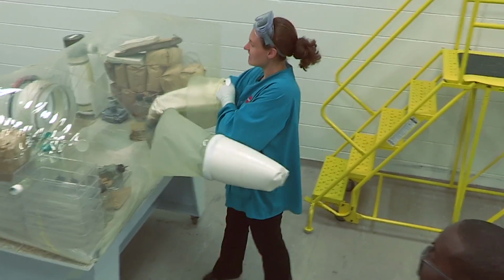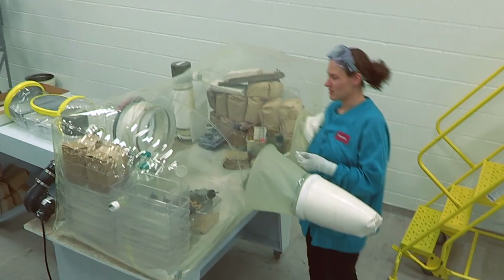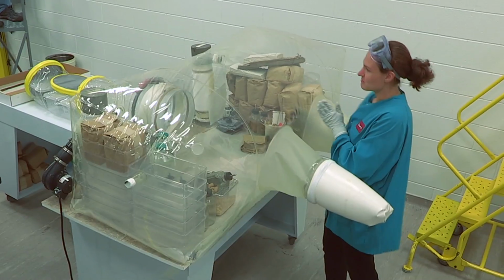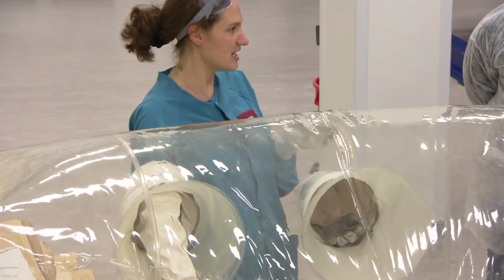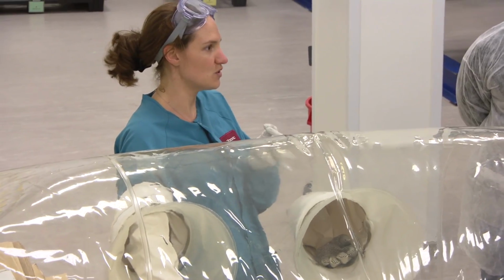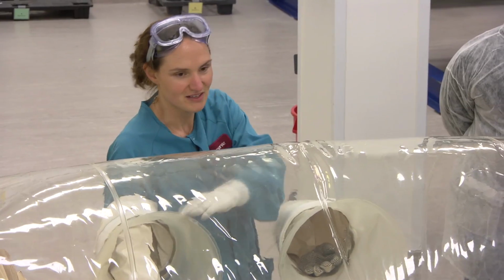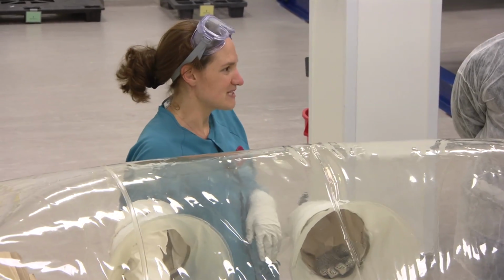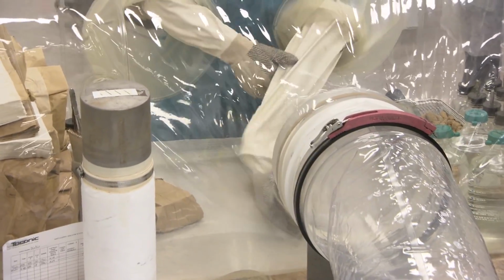All right, so again, our 20-minute wait time. And here again, sometimes it'll take multiple sprays because of the way the atomizer is. We've actually come up with an end piece, which is a long tube, and the tube fits much easier into the end. Of course, I asked if I could use it today, and no, we need that, so they're going to leave me to struggle.